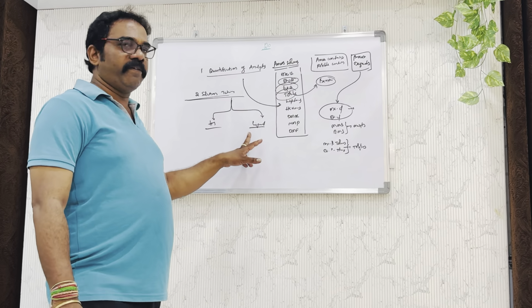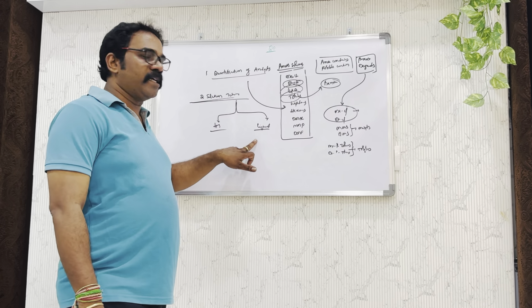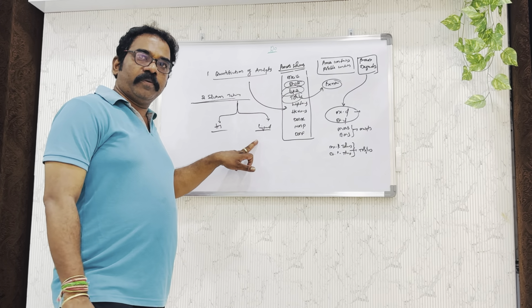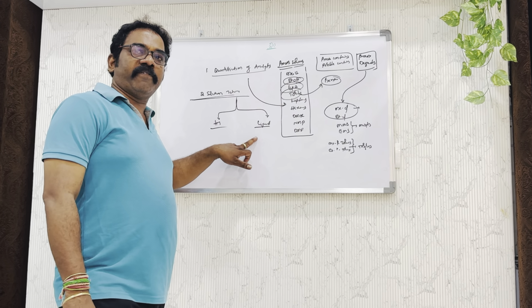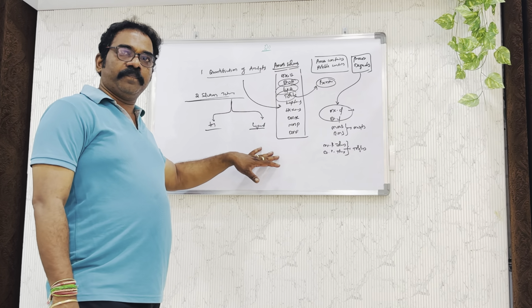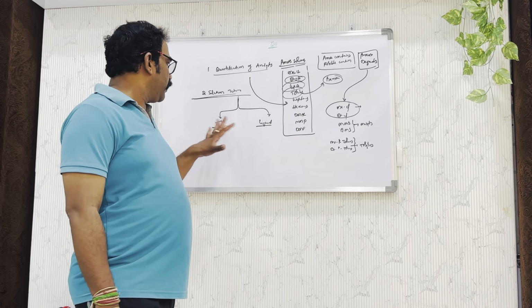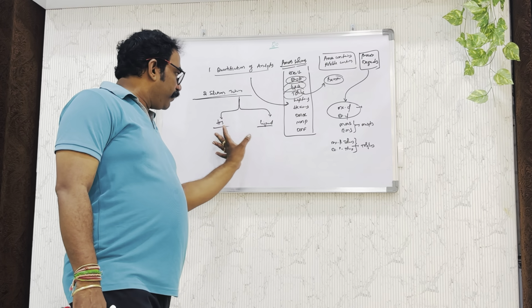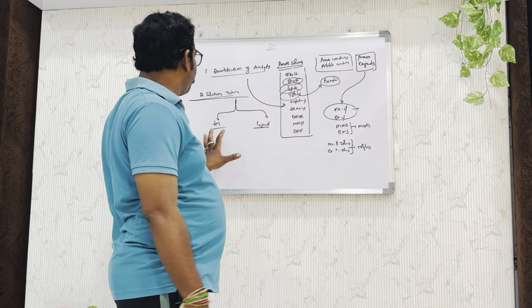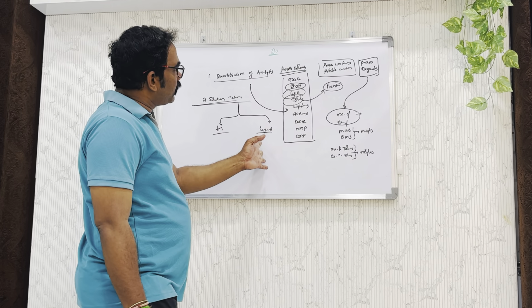When it comes to liquid, the drug substance is dissolved in a suitable solvent and transferred into a 2 ml vial, and we inject through a syringe, 10 microliter or 5 microliter. That vapor goes to the column at the desired temperature kept in the injector port. This is the difference between the two techniques. Now, to quantify these solvents, how do we distinguish in the selection of technique, headspace or liquid?